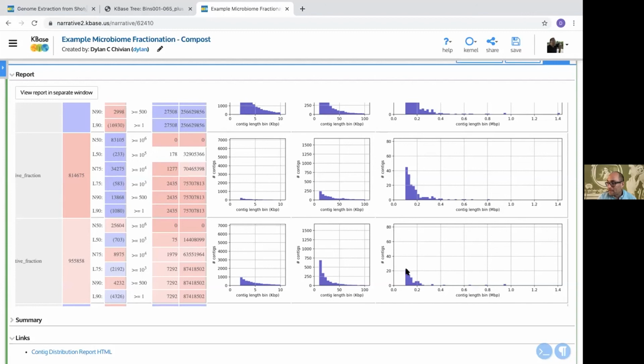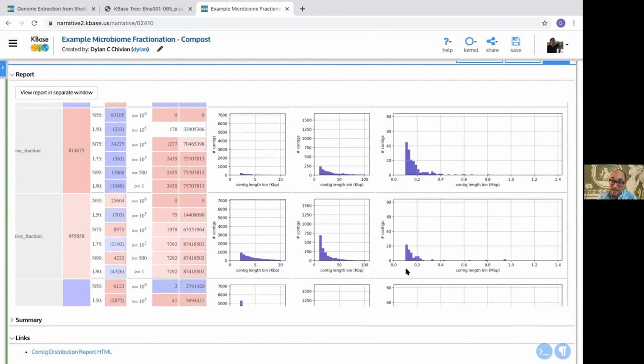And then the longer your contig, the more reliable your phylogenetic placement is, if you're doing a gene-based phylogeny following a Megan-like approach or something like that. And especially if you get phylogenetic markers in there, like a CheckM-like approach, that's very valuable too. So anyway, there's a reason to do this. And at the end, like I said, if you have a high quality mag, you can start to really, with caveats, pretend it's an isolate genome and follow isolate genome type analyses.